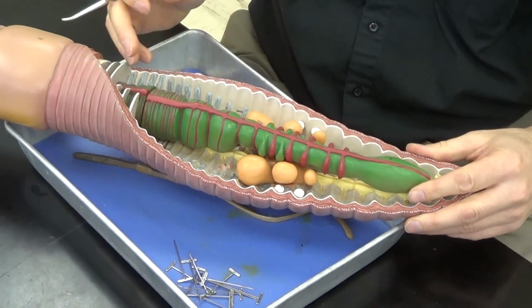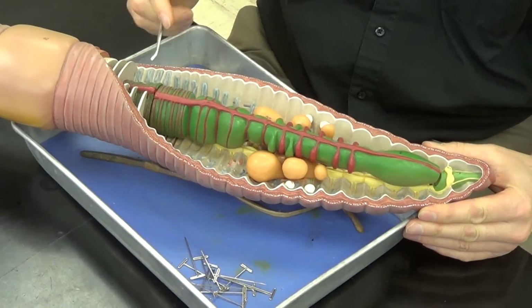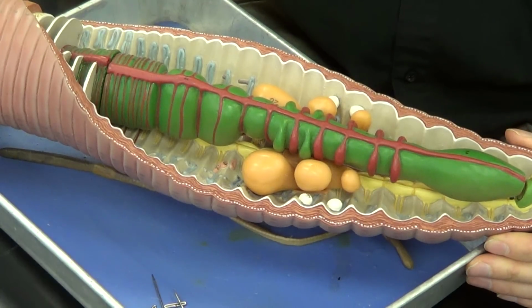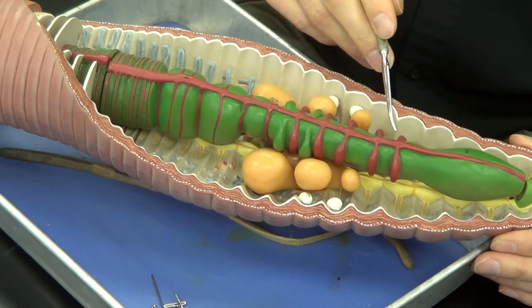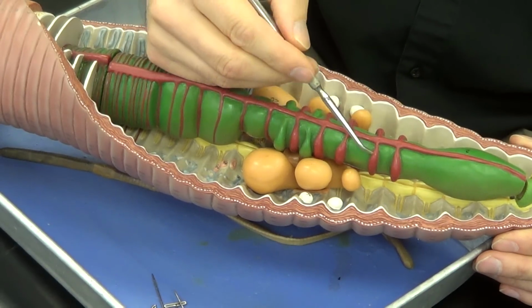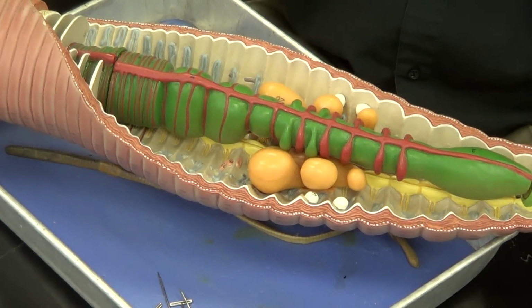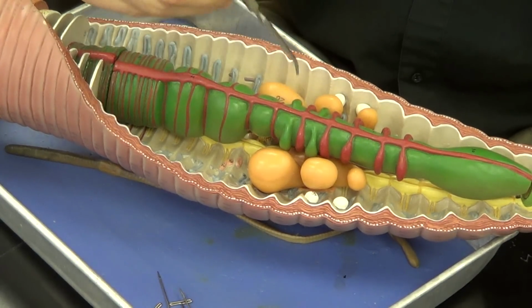Now let's take a look at the blood vessels. We're going to see three major blood vessels on this worm. The one blood vessel you can see right here is probably going to be the most prominent. It's going to be called the dorsal blood vessel, and its job is to return blood to the headward region. And then we can see some dilated blood vessels here on either side, and these dilated blood vessels are called hearts or aortic arches. And their job, they've been modified to pump blood.